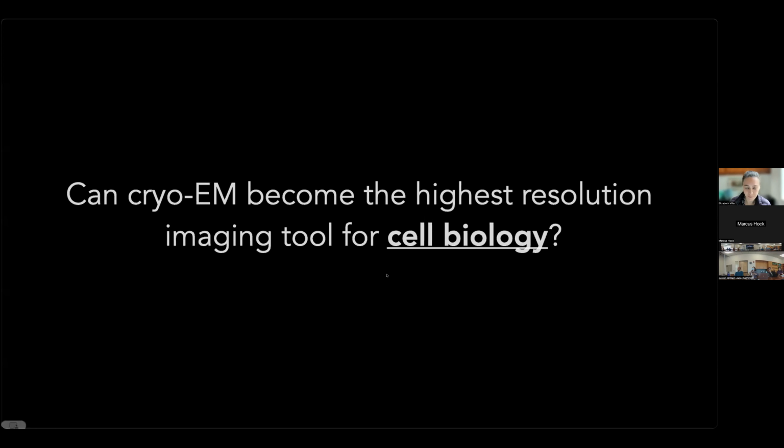All right, so I have a dream slide. I think most of you have probably heard that cryo-EM took structural biology by storm. And I think it's safe to say that almost every lab doing structural biology in any shape or form either is already doing cryo-EM or trying to learn how to do cryo-EM. We underwent what we call a resolution revolution about 10 years ago with the development of new cameras. And it really is now relatively routine that if you can biochemically isolate a protein, you're likely going to be able to get its structure, or that of a macromolecular complex.